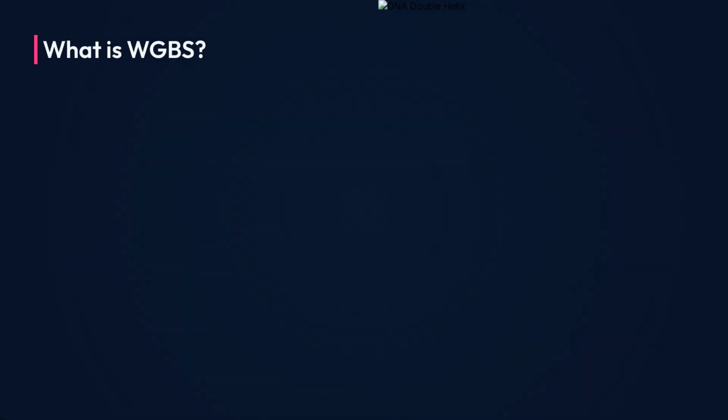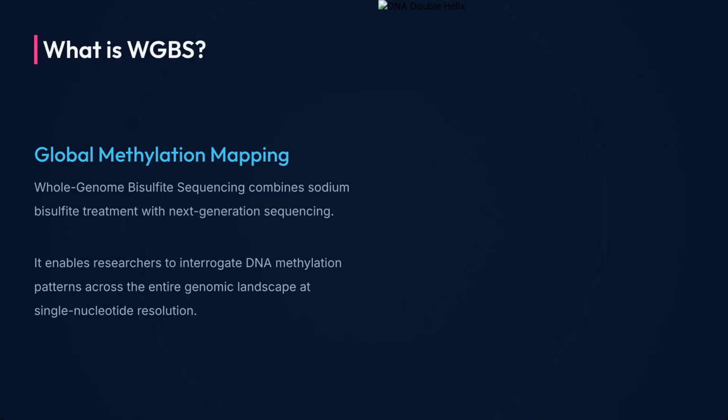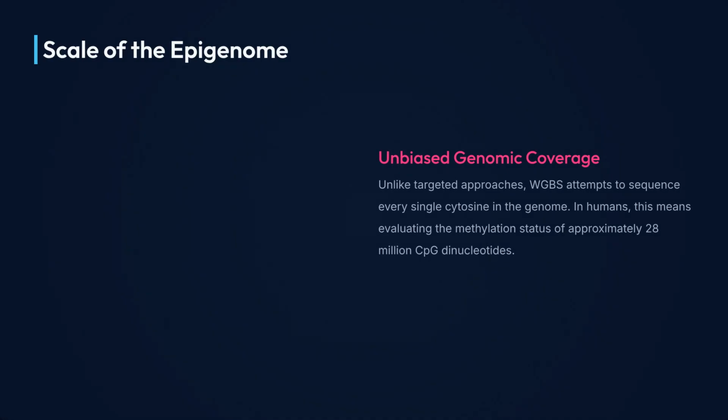What is WGBS? It is a global methylation mapping technique that combines sodium bisulfite treatment with next-generation sequencing. This enables the interrogation of DNA methylation patterns across the entire genomic landscape at single nucleotide resolution. WGBS provides unbiased genomic coverage.